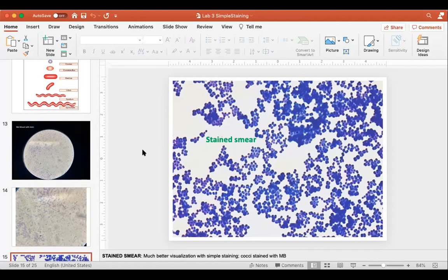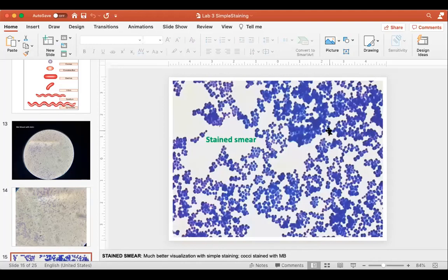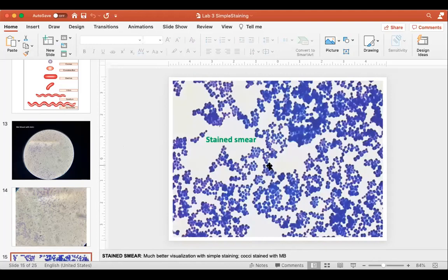And if I needed, oh, sorry, go ahead. I'm sorry, I was just wondering, would the fungus just be in the white background in this? Oh, I actually cheated a little bit on here in that after I saw that the culture was contaminated, I actually made a fresh culture for the smear. Okay, so no fungus in here. If there were fungus in here, these would have picked up the methylene blue too. So you'd still see the fungal branches, the fungal hyphae in there, and they would be blue as well. Good question.